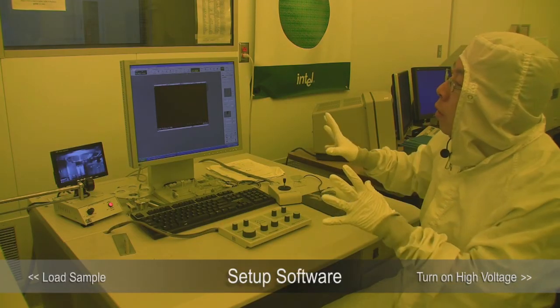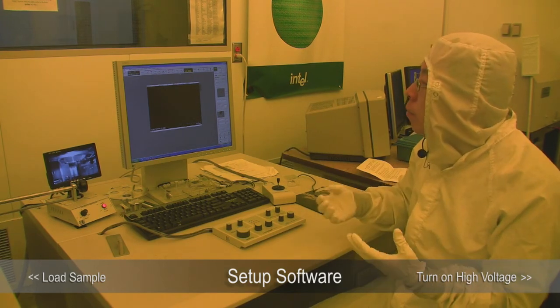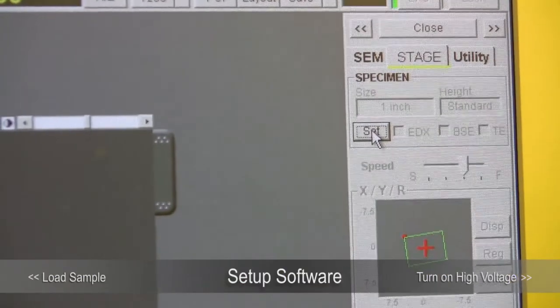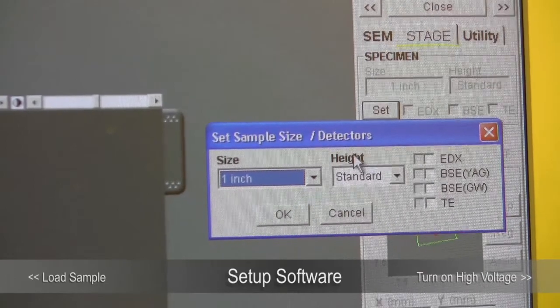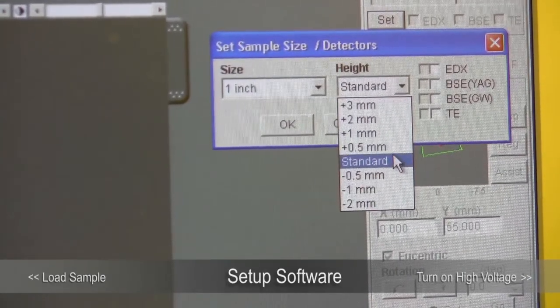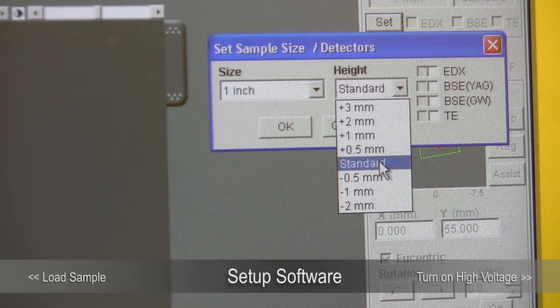The rest of the operation is basically through the computer software, which will protect you from doing something damaging. The last thing you need to do is go to the stage button and click Set. This allows you to set the sample holder size and the height. Remember the standard height — if you adjust the height near that standard height, that is the standard height. If it's higher, the maximum allowed will be 3 mm higher than the bottom surface of the standard height; otherwise it won't go through the opening.